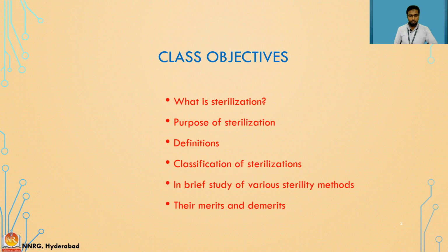So today's class objectives will be to know what actually sterilization is. Okay, and after that, what is the purpose of sterilization? Whatever we do in science, there will be a specific reason. If we are taking some paracetamol, there is a specific reason because we have fever. For that reason, we take paracetamol. There is a specific reason for each and every act that we do in science. So what is the purpose of sterilization, that will be seen.